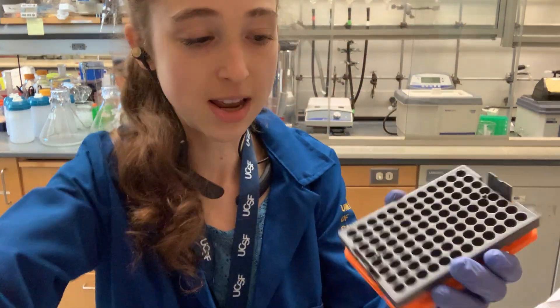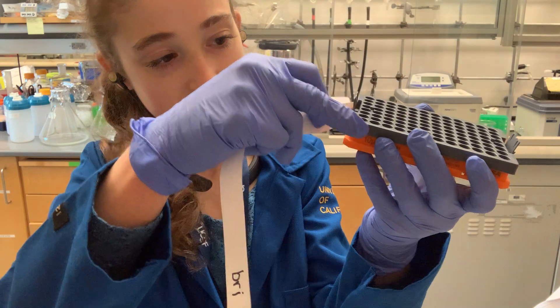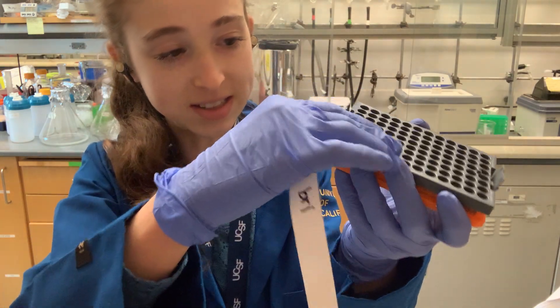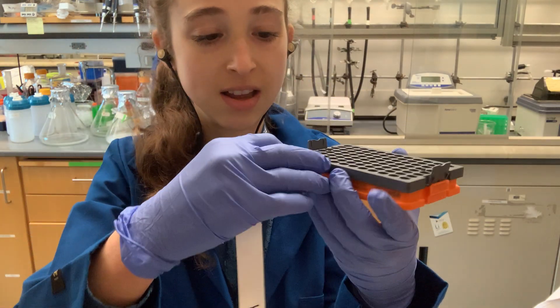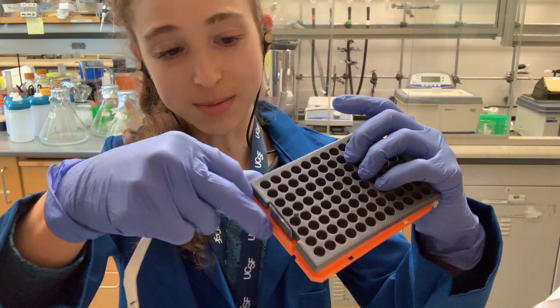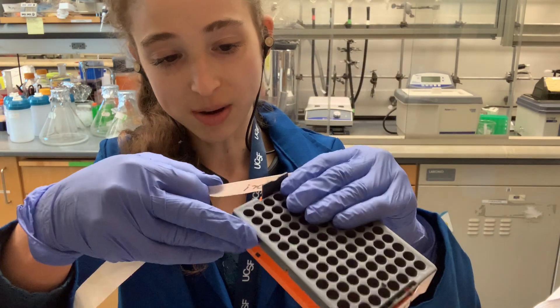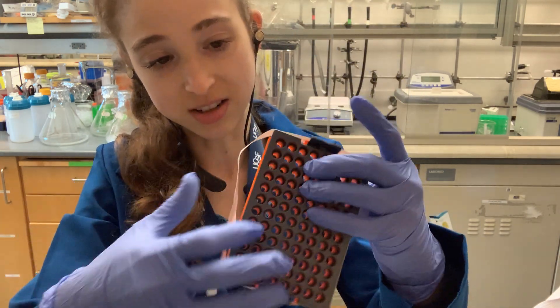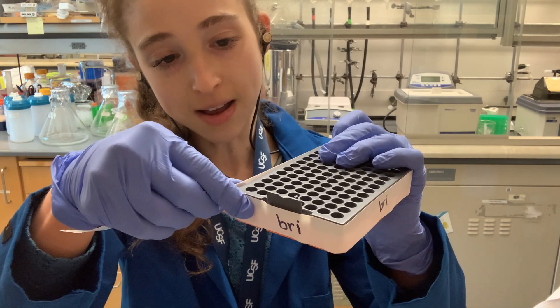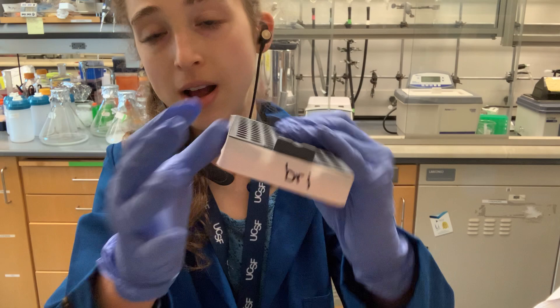Then all you have to do is take your tape. You want to make sure you're not taping on the bottom in a way that will stop it from standing. If it's too big or on the bottom it won't stand properly, and if it's on the top it can get in the way of your tubes or stick to them. Then just tape it around, and voila!